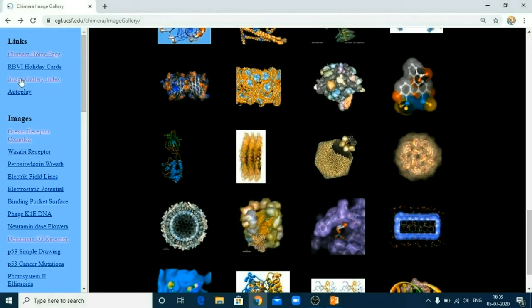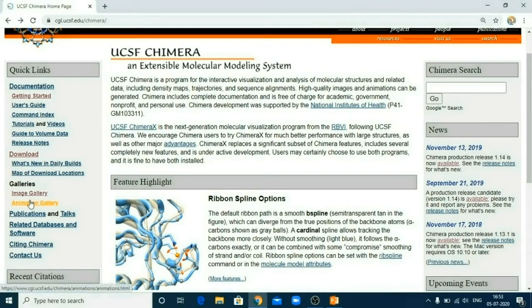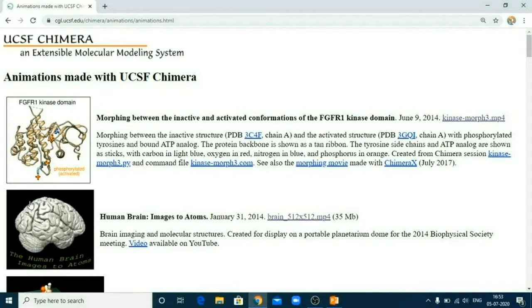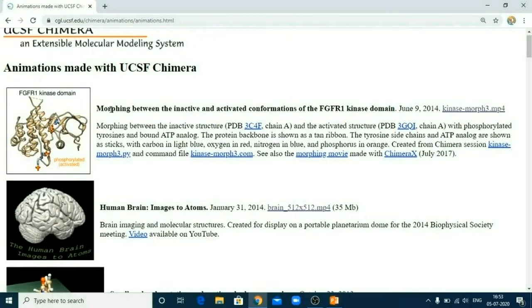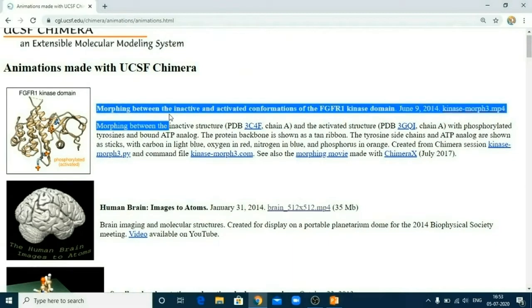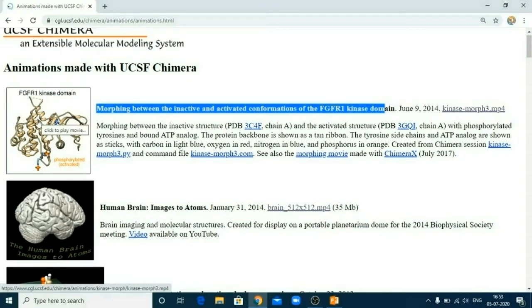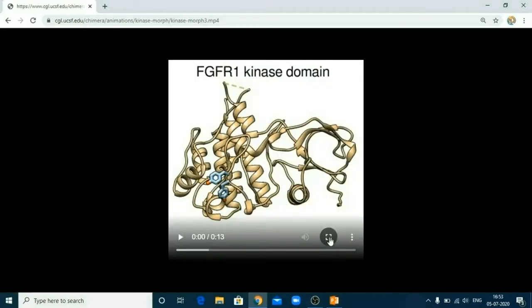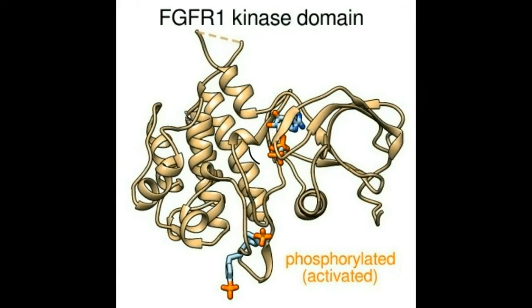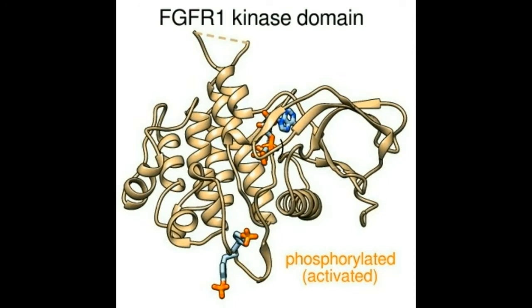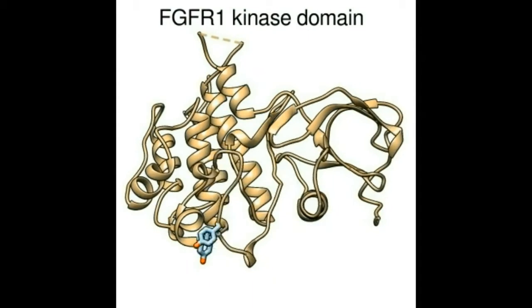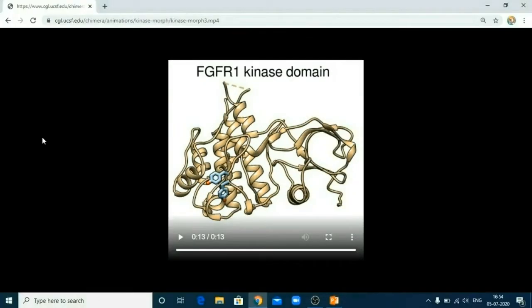Not only image formation, but UCSF Chimera can also be utilized for producing your own movie. There are various examples given. The first movie created is a morphing between inactive and activated conformation of FGFR1 kinase domain. Let's see how the movie looks like. Now you can see the protein is moving. When it is phosphorylated, it is in active form. So the active form of the protein is like this. And when it is not phosphorylated, let's see how the protein changes. So this movie is created with the help of this software.